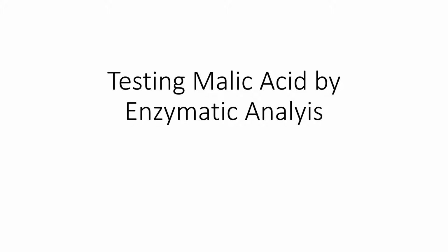Hey everyone, this is your 3-minute introduction to testing malic acid by enzymatic analysis. We're going to use a spectrophotometer. It sounds complicated. It's not. A spectrophotometer is built to do one thing, and that's measure light.